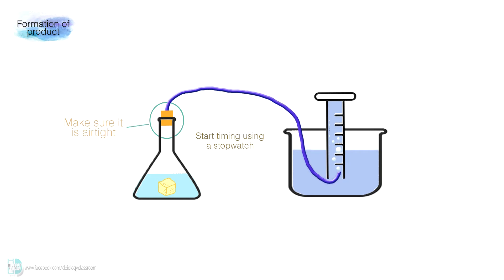Oxygen formed in the reaction will appear as air bubbles in the measuring cylinder. After a fixed time, record the volume of oxygen collected in the measuring cylinder. The rate of reaction is the volume of oxygen collected over time.